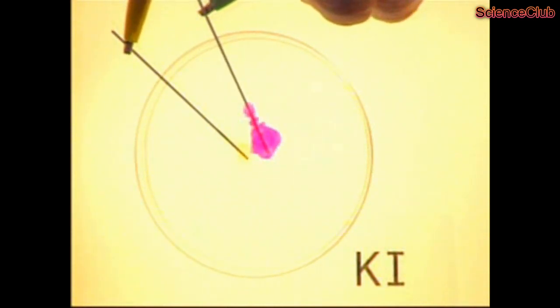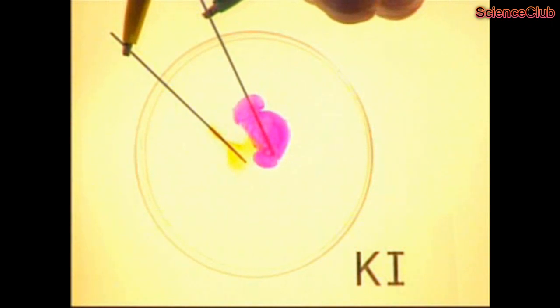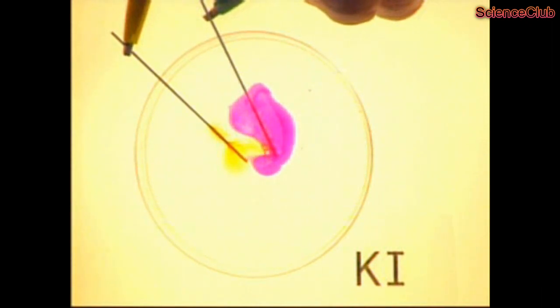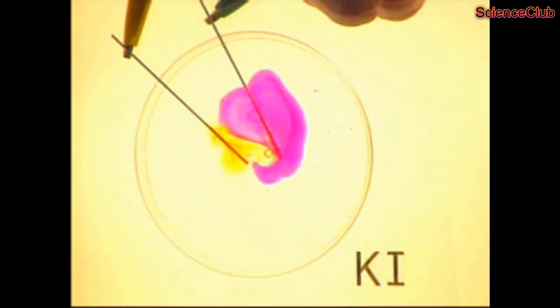The bubbling is occurring at the cathode as hydrogen is produced, and the solution around the cathode is turning pink as the hydroxide is generated in the presence of phenolphthalein. The solution around the anode is turning yellow-brown as I2 is generated and combines with the I- ion to form I3-, which is brown in color.